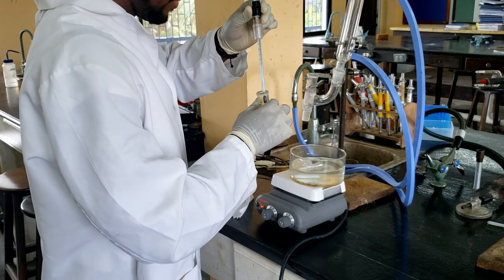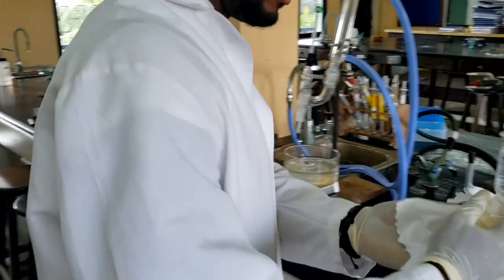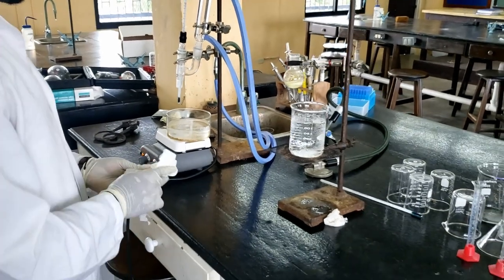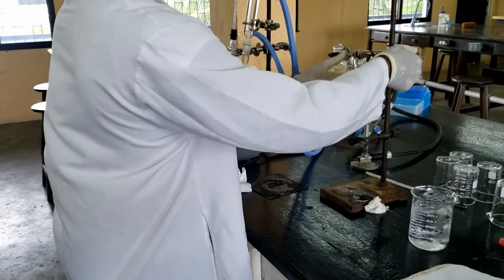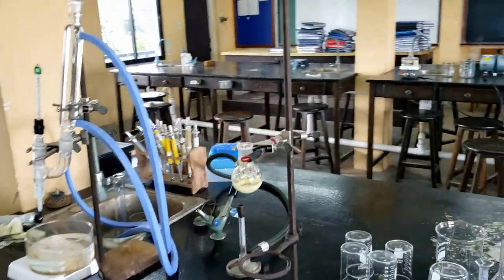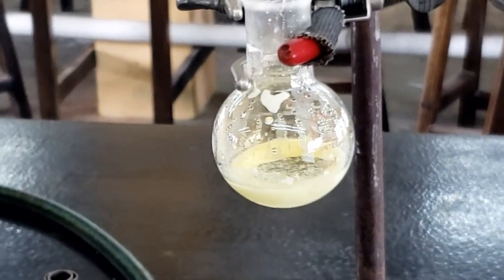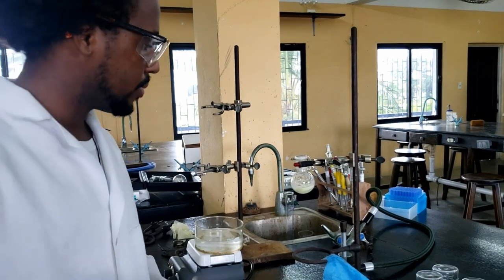We have some of the product on the thermometer. And then I'll allow this to cool to room temperature on its own. I'll just leave it clamped here and let that cool to room temperature. Okay, so we've allowed the solution to cool down to room temperature.